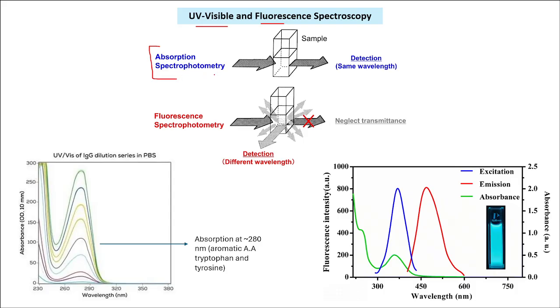this is the light source. The light passes straight through the sample, and we detect that. In the case of fluorescence spectrophotometry, this is the basic principle. I guess all of you would already know absorption, fluorescence, emission, but still we'll touch upon some of the very important points that need to be revisited, and some of the principles that govern these spectroscopic methods.